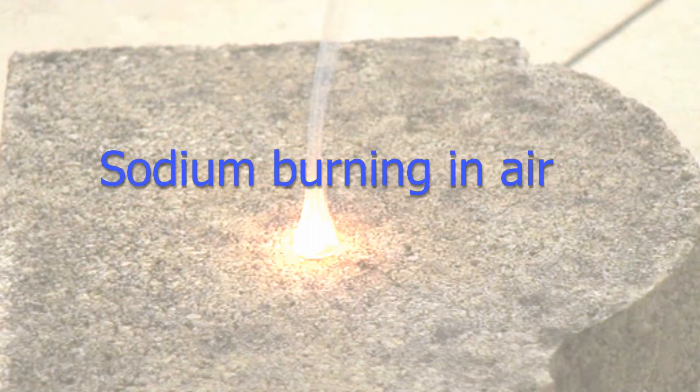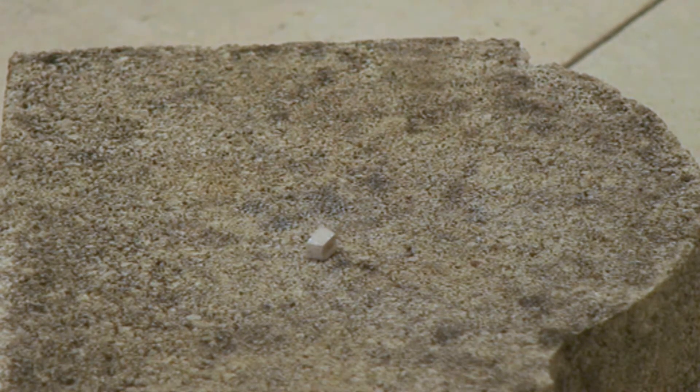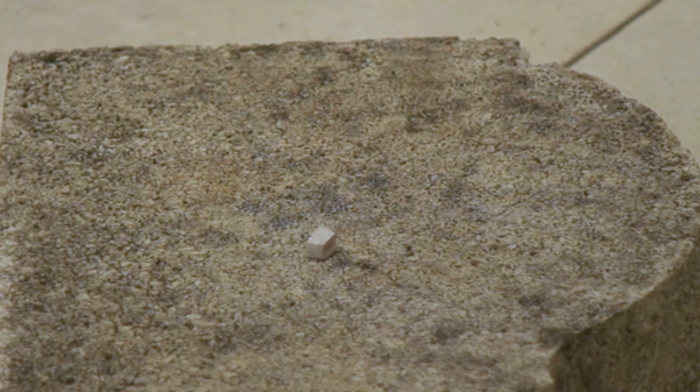After seeing how rapidly sodium reacts with water, you might think that it would catch fire even more easily in air. It turns out that this is not the case.